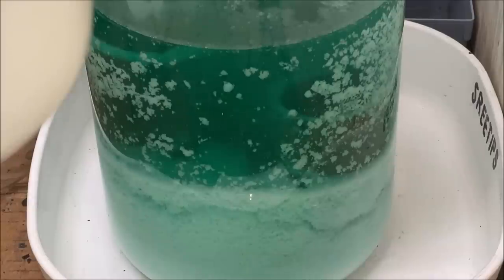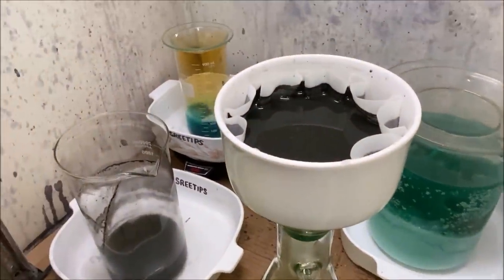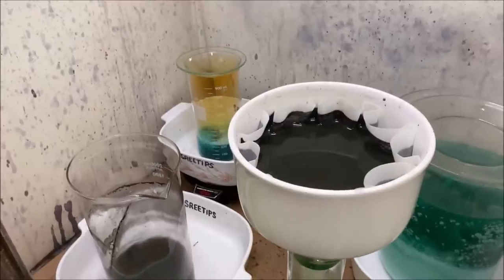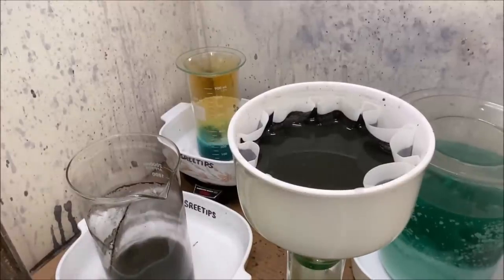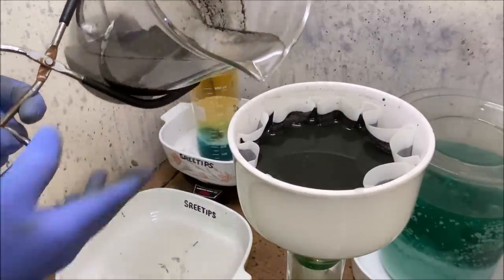If you notice back here in our silver jar, the sulfuric acid that we've been using combined with the silver nitrate to form silver sulfate. So I'll have to convert that to silver chloride with hydrochloric acid and recover it that way. I'm not going to do that in this video, though. I just wanted to point out what happened back there. That's why you see that white fluffy material back in that beaker. It's silver sulfate.